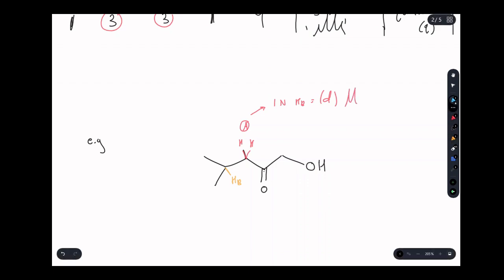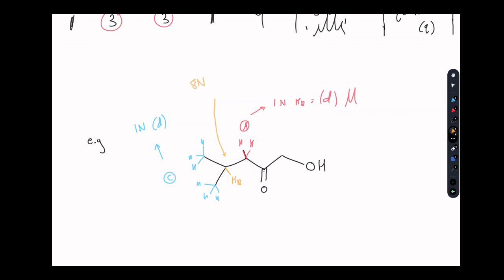HB is going to be an interesting one. So here we have 6 different equivalent hydrogens. Call them all HC. Now HC, it's going to only have one neighbor as well, right? It's too far away from HA. It can only have its 3J coupling with HB, so it's also going to show up as a doublet. But HB is stuck in the middle. It has 2 neighbors on its right side, 6 neighbors on its left, for a total of 8 neighbors.